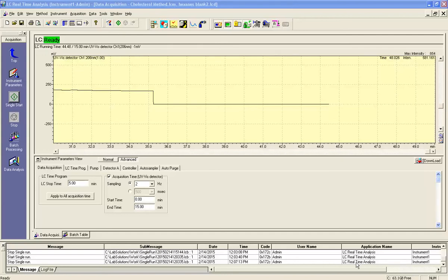Okay, software, software, software. When are you going to stop the software? Because it's driving me crazy, right? It's all of these tabs, and all of these buttons, and all of these things that are going on. And like I said before, the software, most of the time, is harder to use than the actual instrument itself is.